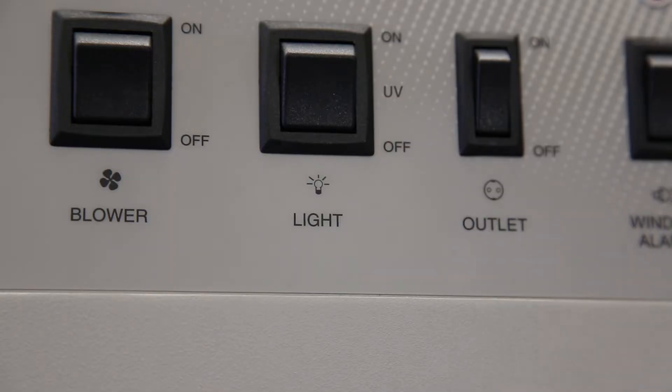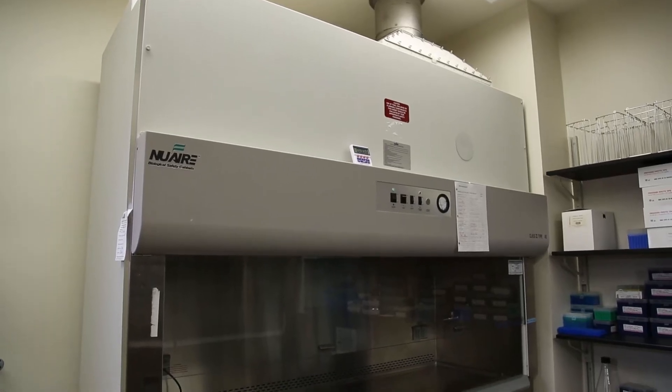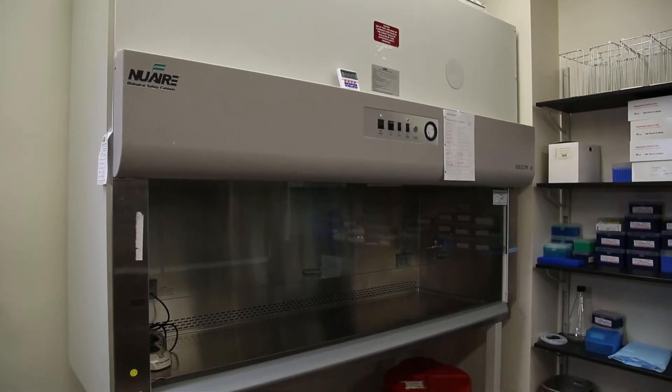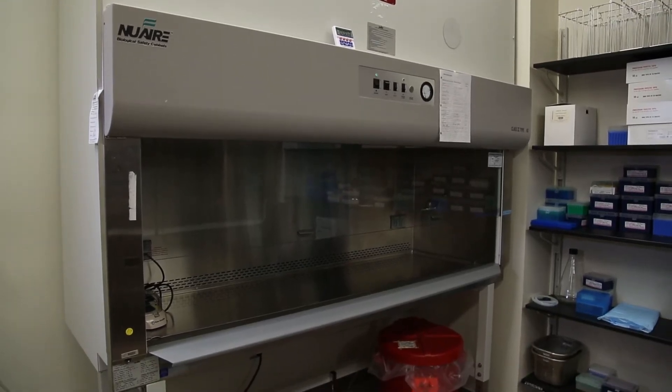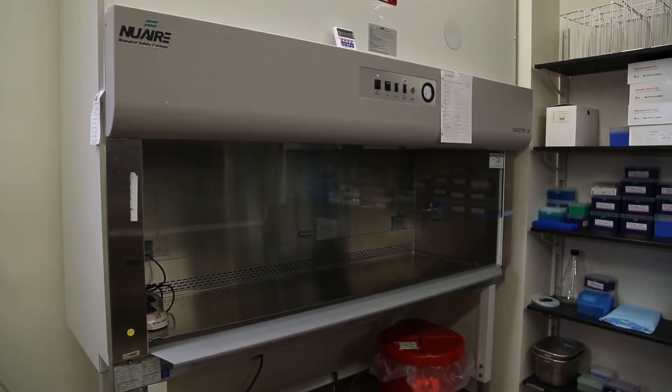If you have a UV light, you may or may not turn it on as per your SOPs. Some labs will leave their BSC blower motor running continuously. In that case, you could turn off the light but leave the sash open.